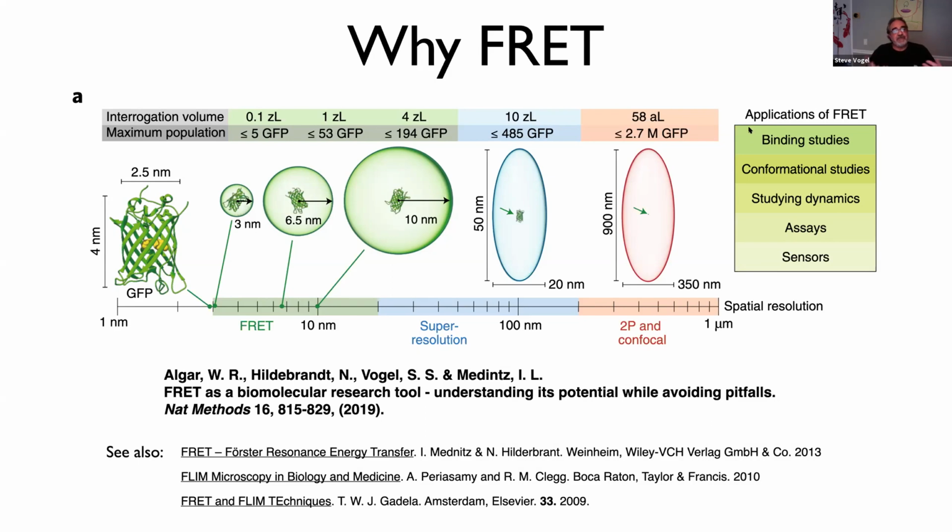And it's a physical phenomenon where you excite one molecule, one fluorophore, and under certain conditions, it'll transfer its energy to a nearby molecule. And that phenomenon is usually based on the distance separating those two molecules. And that's what most biologists are interested in.